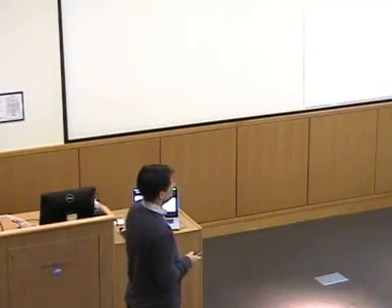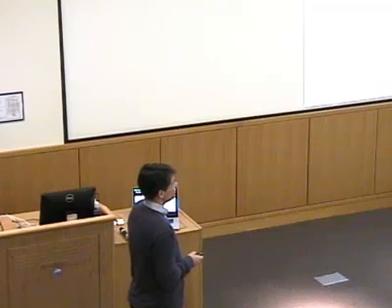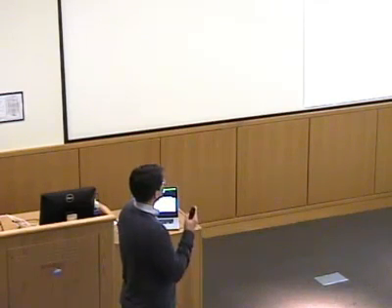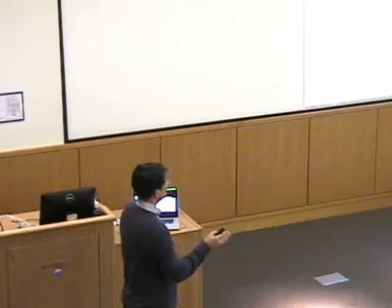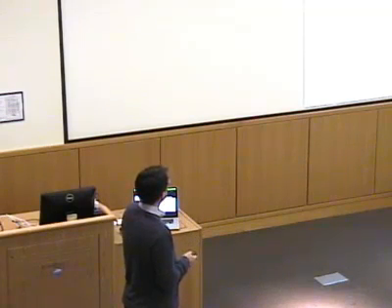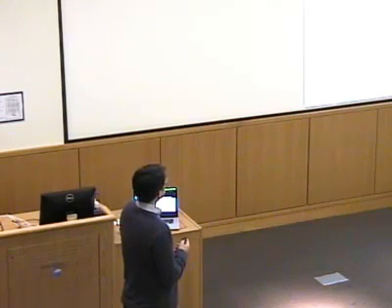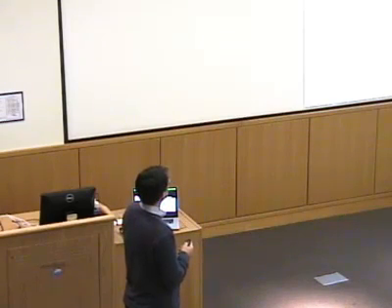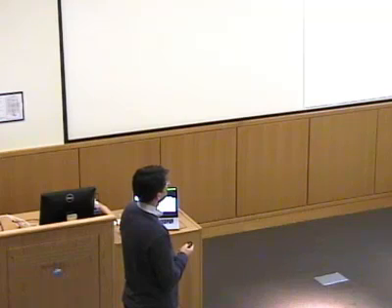So, I think I have been quite a bit slower than I thought I would be this morning, and I think I will just wrap up here rather than rushing you through even more information. I hope I've provided you with a bit of insight into vibrational spectroscopy. I've talked about force constants that measure the stiffness of internal molecular motion. These are stretches, bends, and torsions.